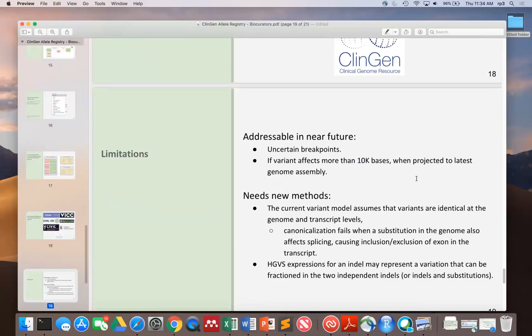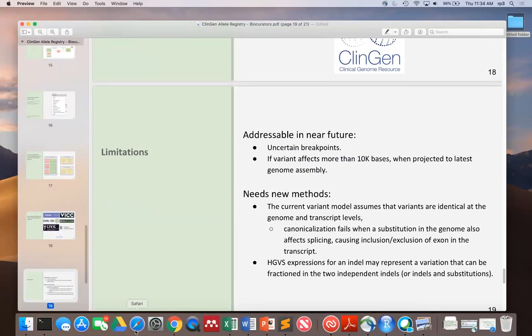Yeah, I do, Deb. Ronak, do you know what I'm saying? I didn't understand exactly what you're saying. Are you talking about when you enter the CA ID and click on start curation, there you see a list of HGVS expressions? Are you talking about that?